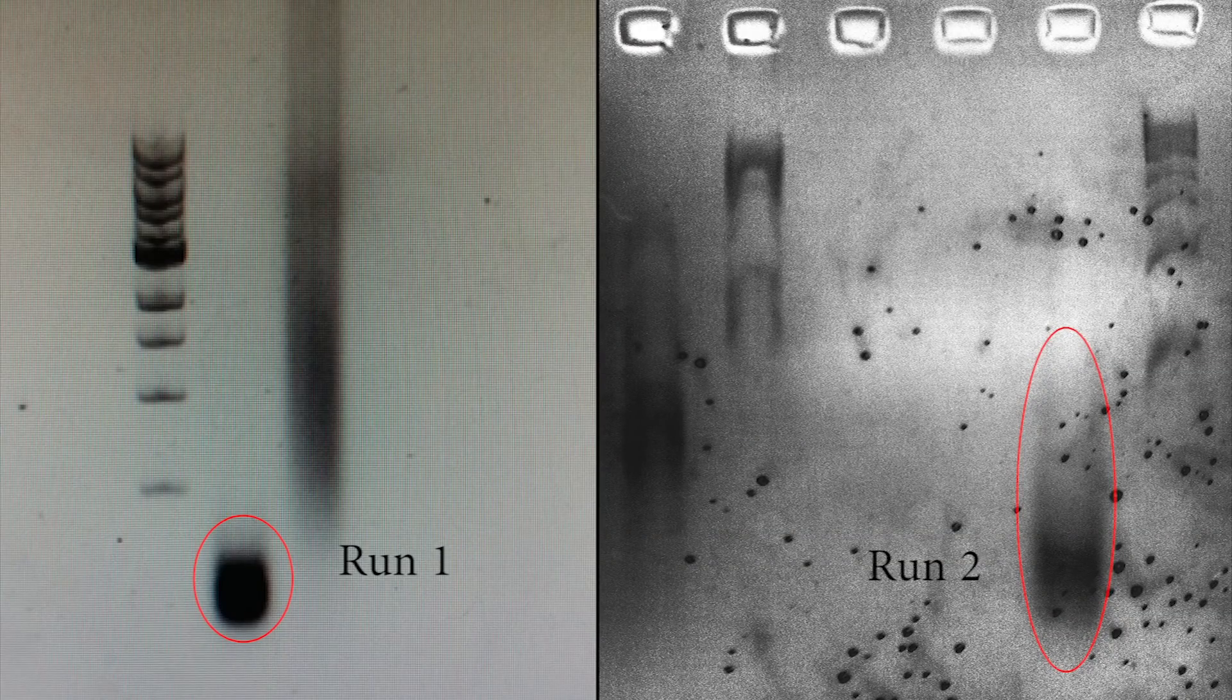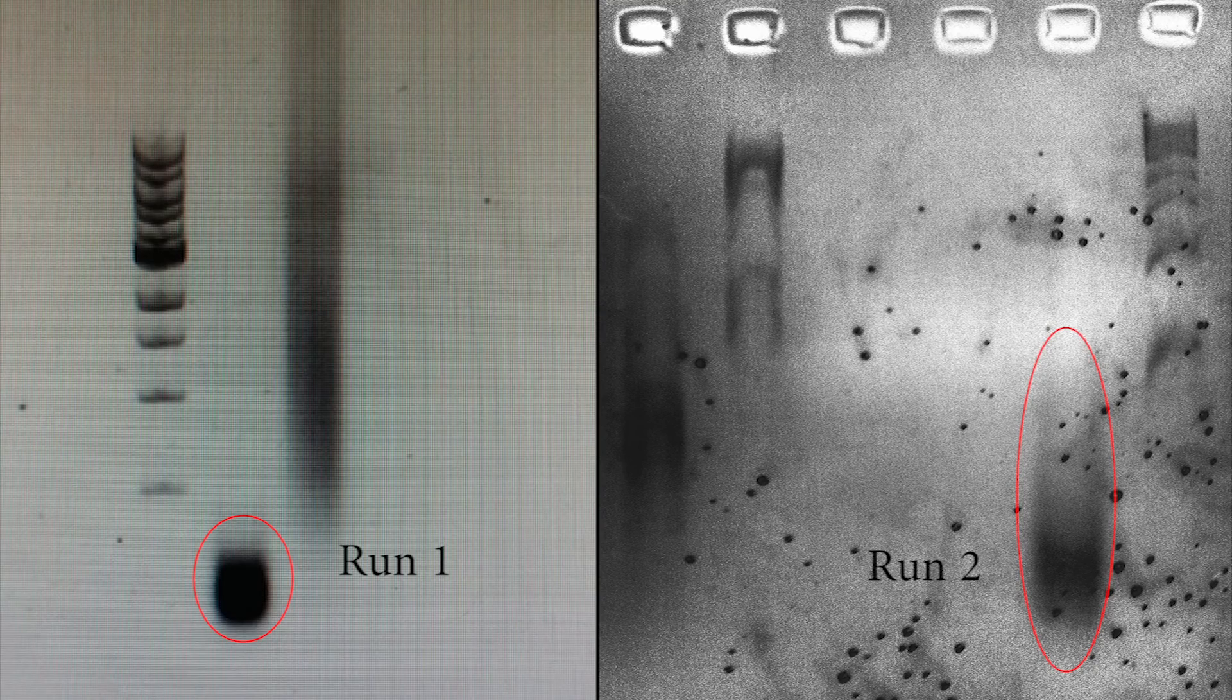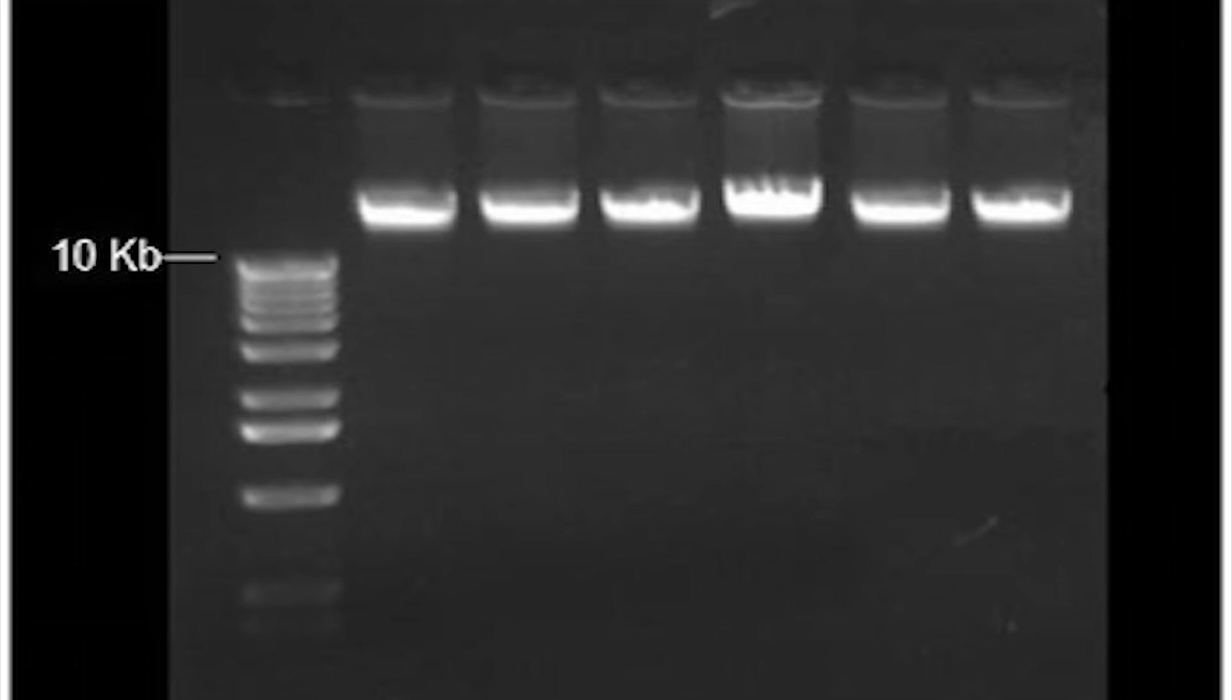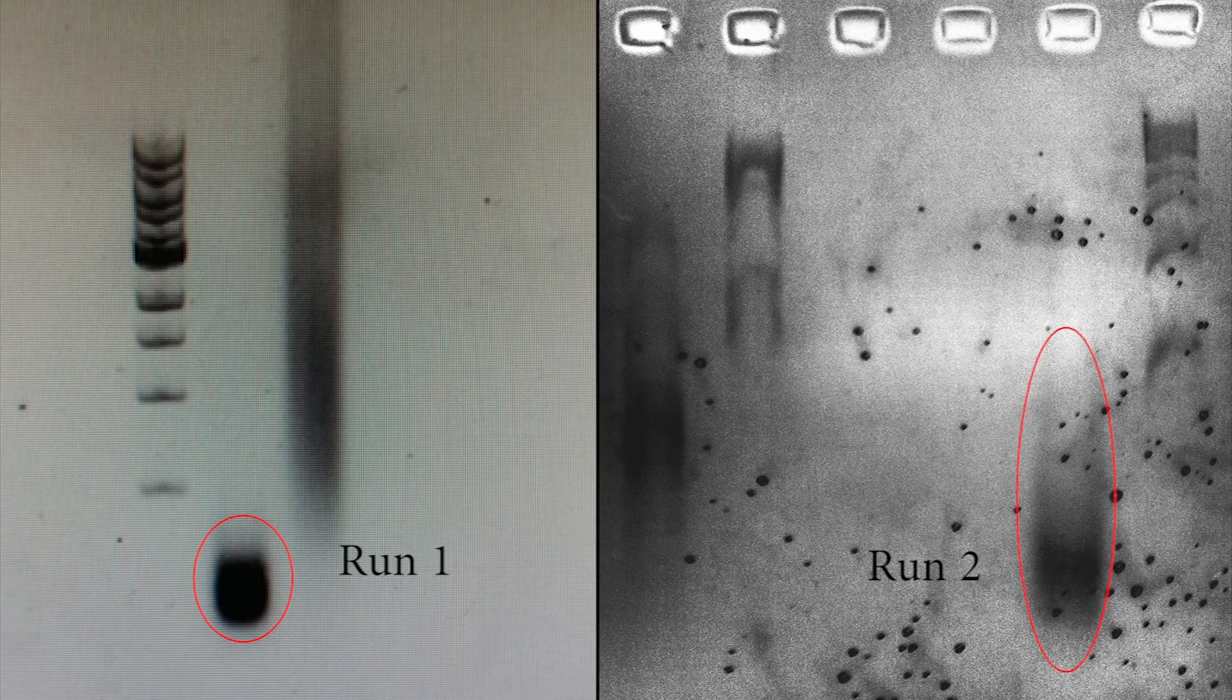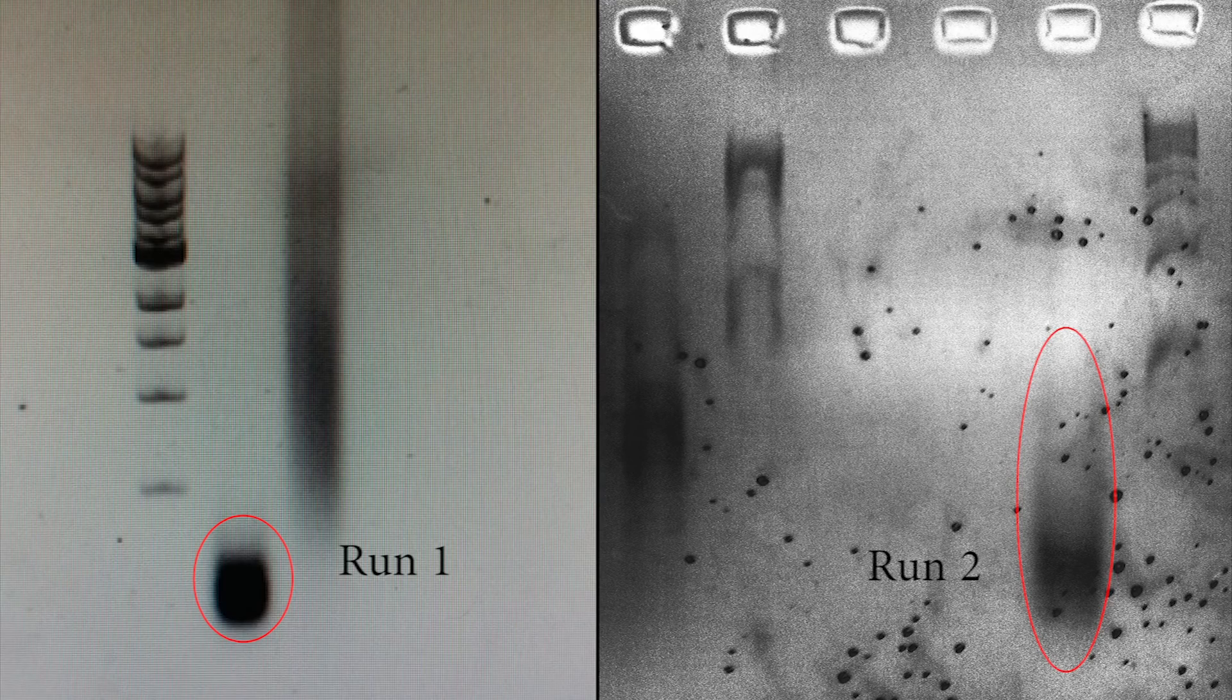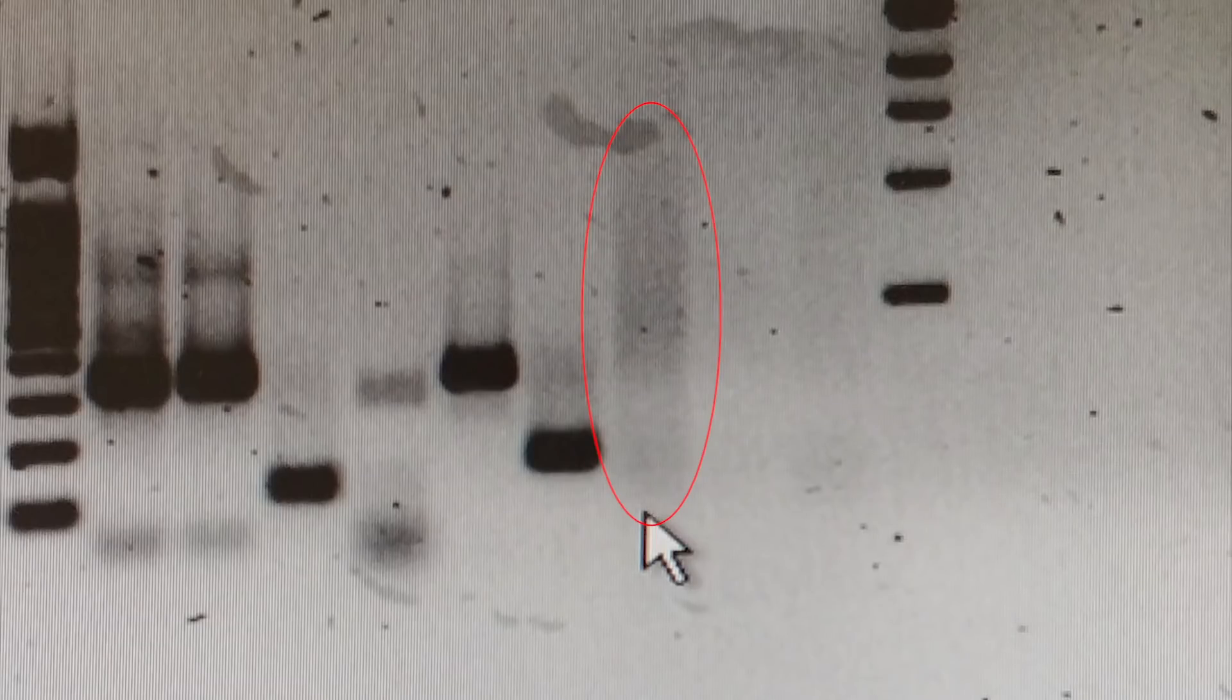But there's a problem with the spiders. In theory, we're supposed to be isolating genomic DNA, which is huge strands of DNA. As we discussed in the gel electrophoresis video, this should look like a nice band near the top of the gel. But the spider DNA looks like a smear low on the gel, which means it's highly damaged, and most of what we isolated is shredded DNA fragments.